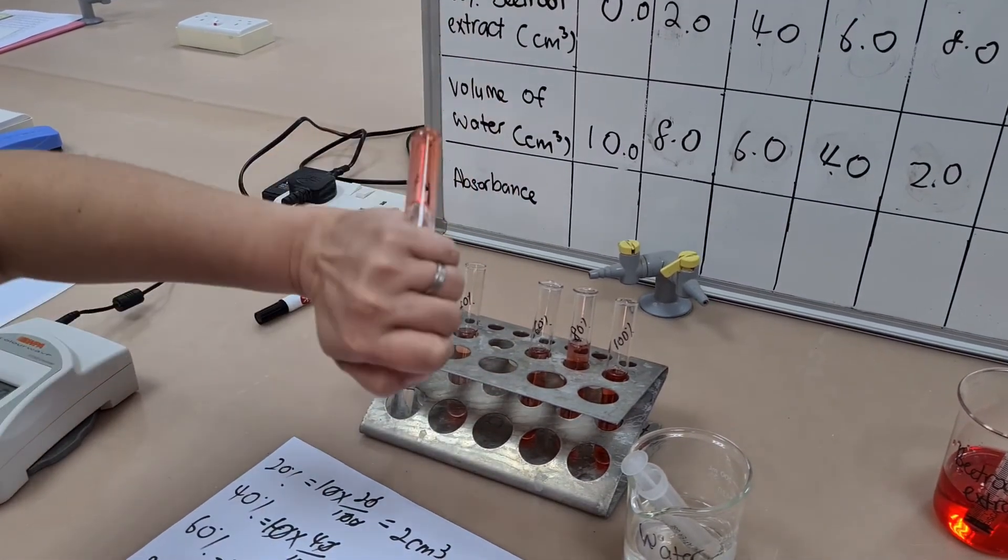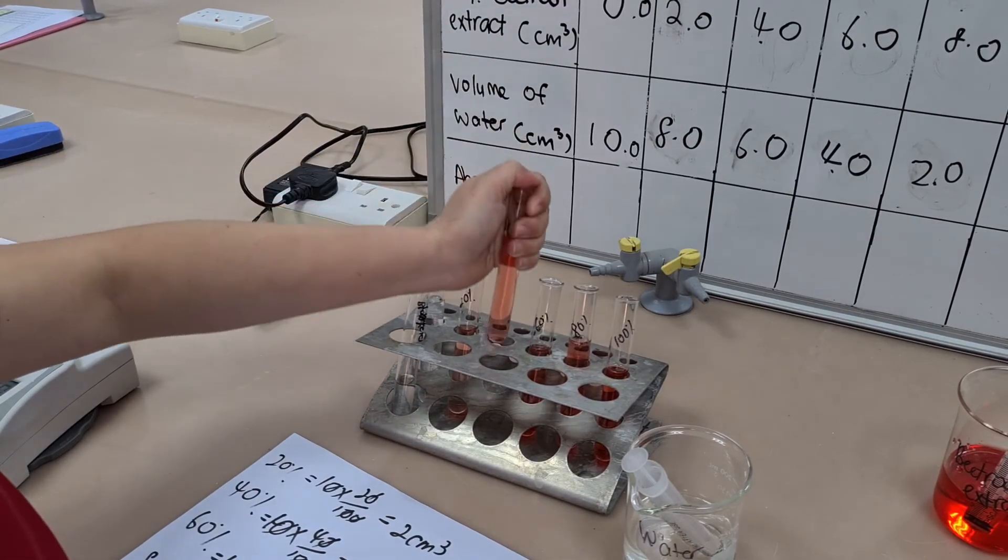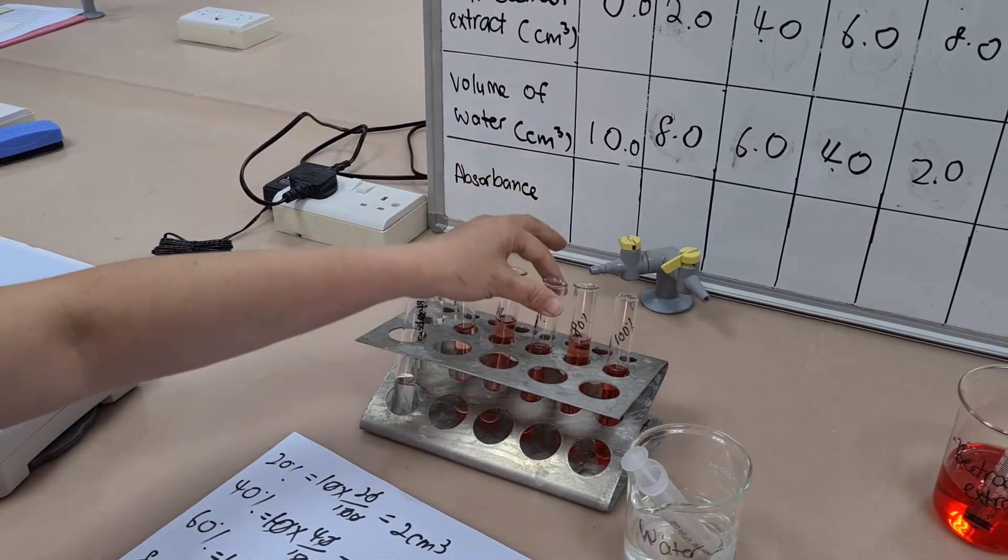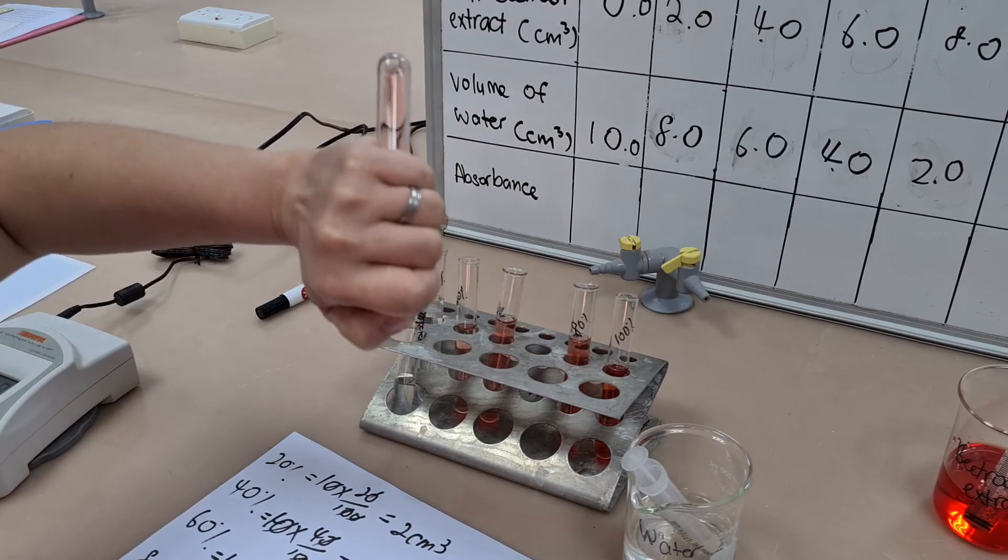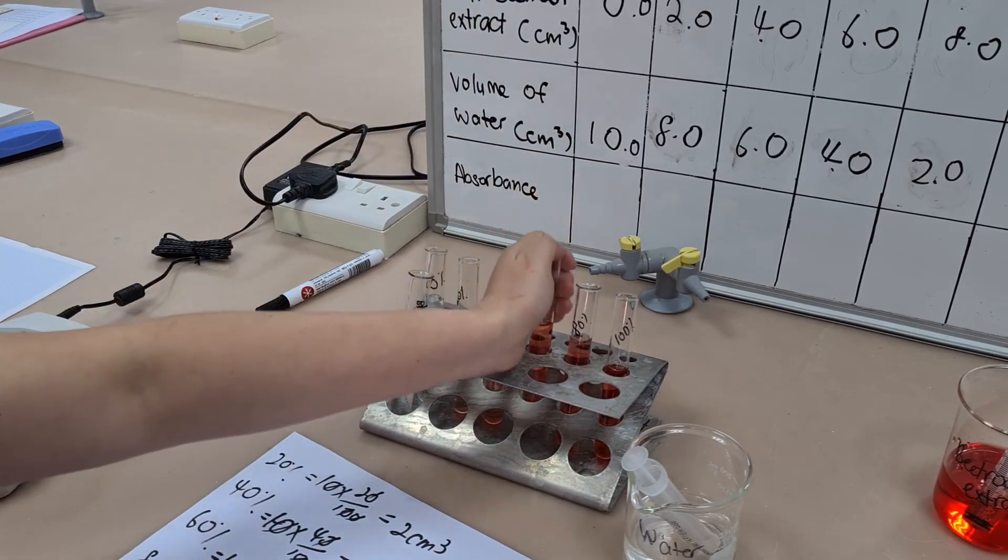So one of the things I notice that happens to students is that they do their measuring perfectly, but when they align their test tubes, liquids are at different heights. And the first thing they think is that they've actually measured it wrong, but in actual fact, they haven't.